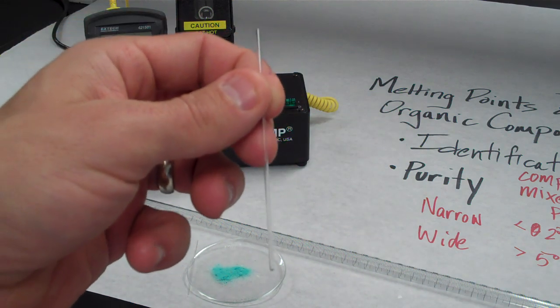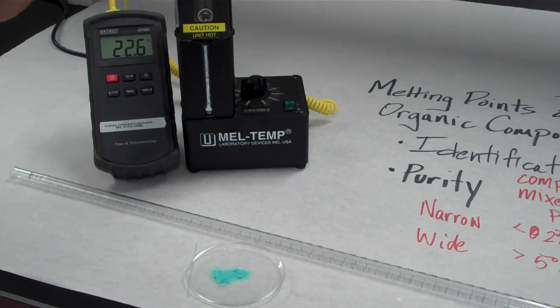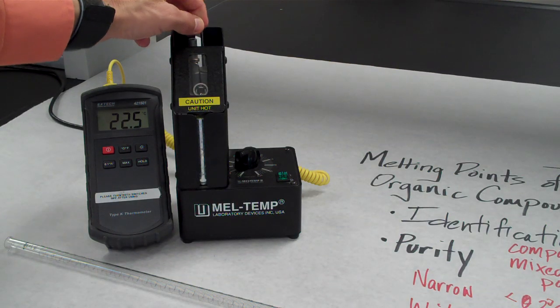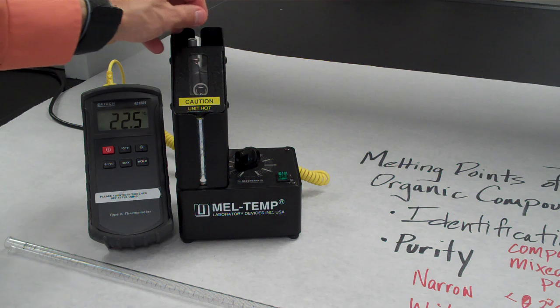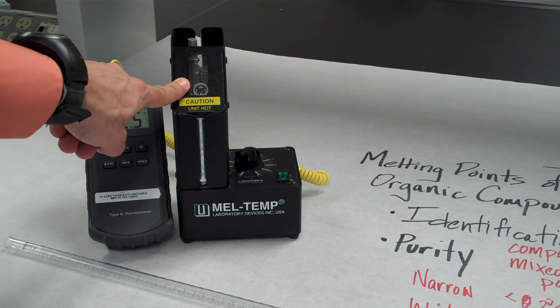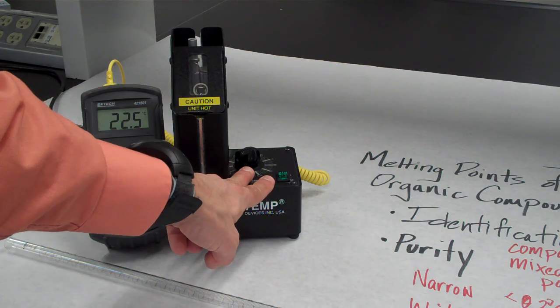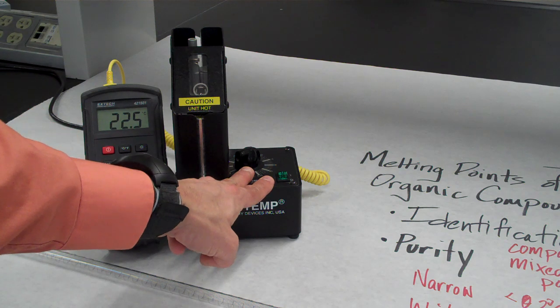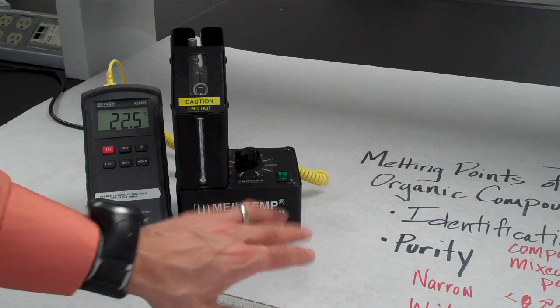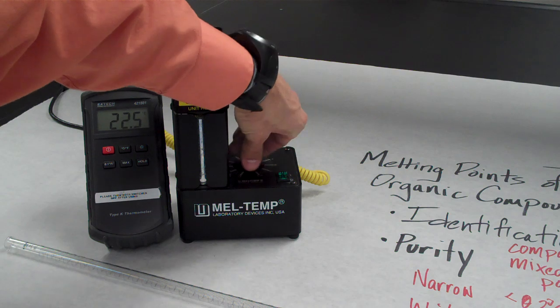These tubes have a small amount of the material of interest placed into them, and then they are inserted into small slots in the analyzer. And there is an eyepiece through which you watch the sample as you heat it. So you would activate the heat, which is really nothing more than a fairly intense light bulb, whose brightness and therefore the amount of heat that it's producing are controlled by a very small dial here.